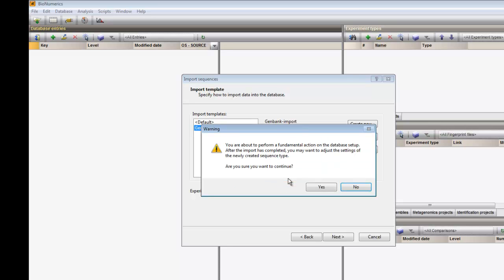Again the warning pops up saying that I am about to perform a fundamental action on the database setup. This action will be the creation of a new sequence experiment type. Please note that you need administrator privileges to do so. I confirm.